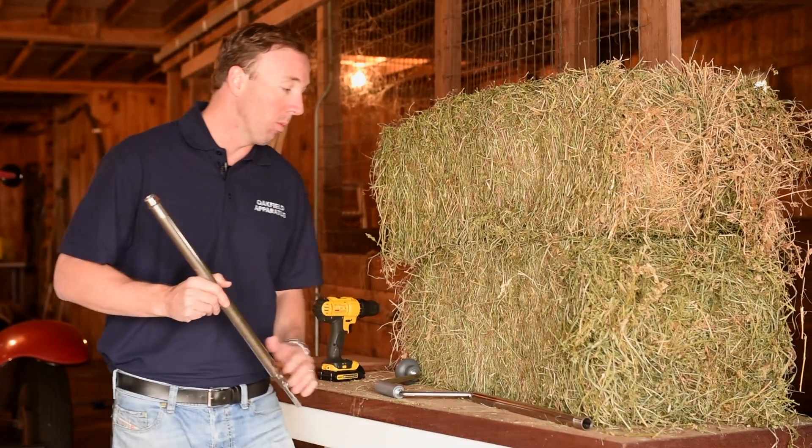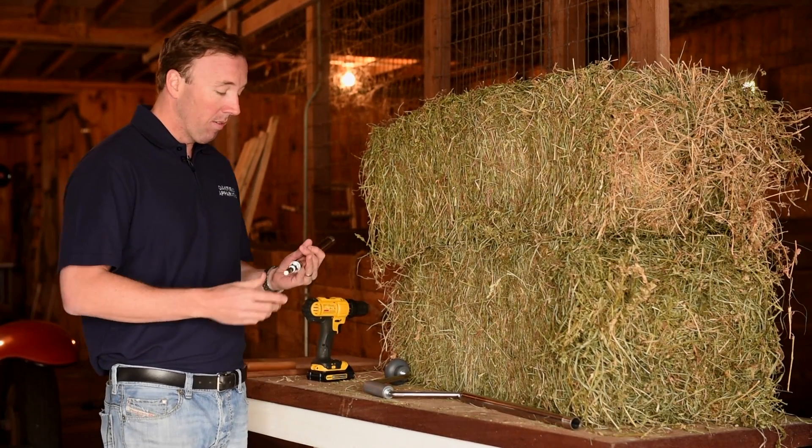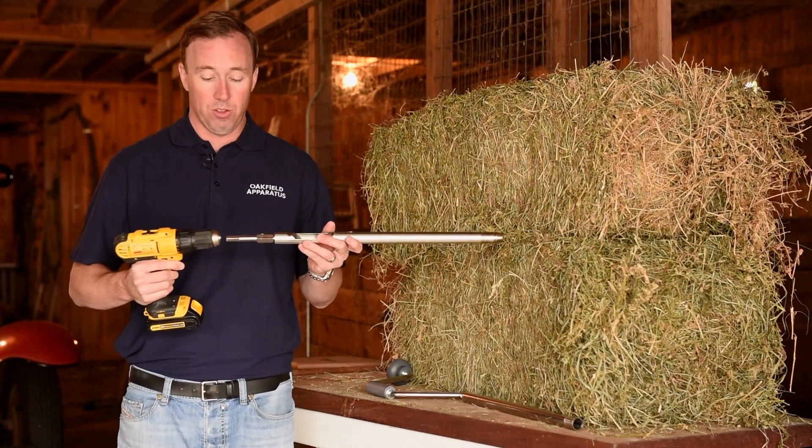The great thing about the probes is they can easily be either hand cranked into the hay, or via this hex adapter, be put into any standard half-inch drill.